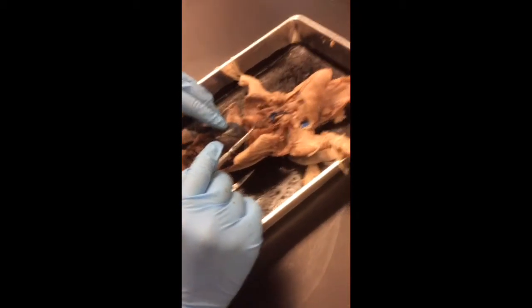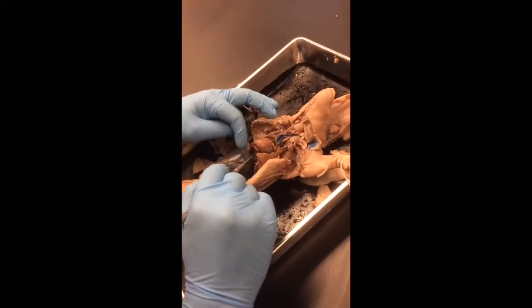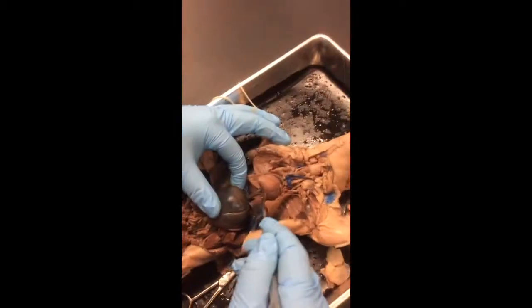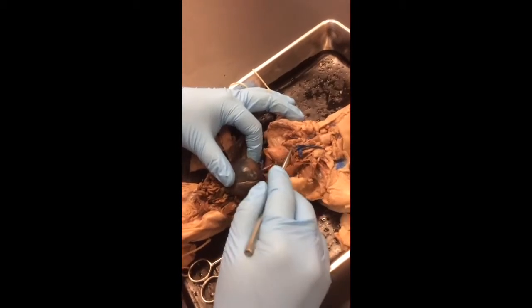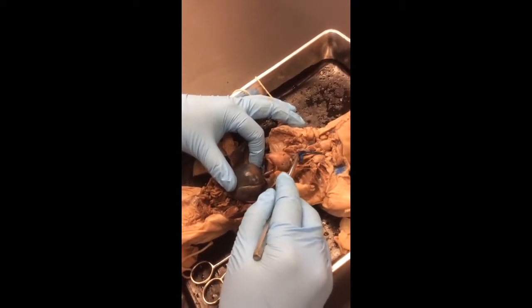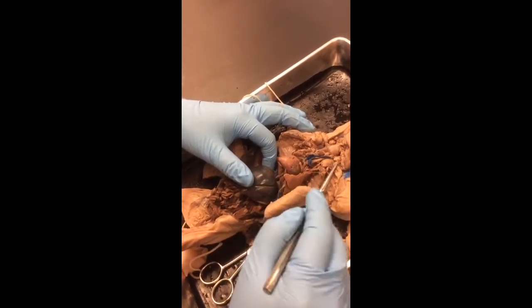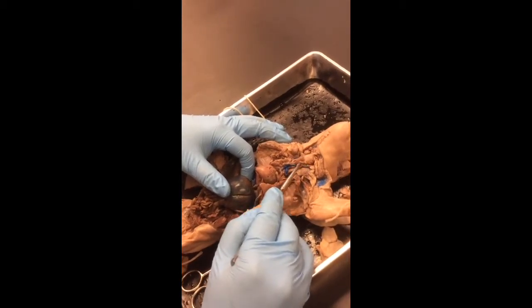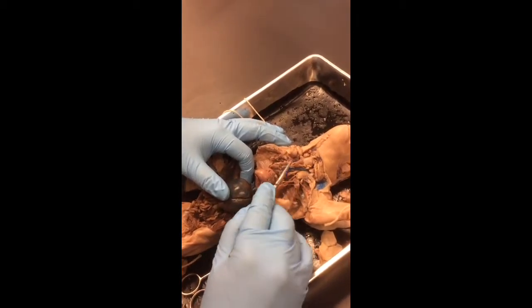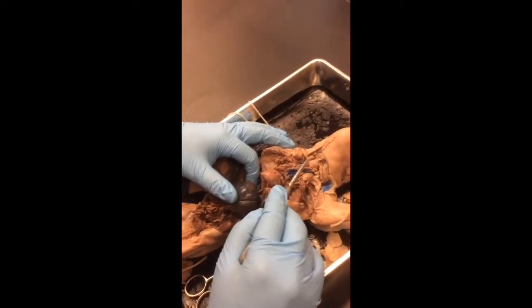All right, posterior vena cava is the inferior one, so we usually show it right here underneath the heart, above the liver. Right, it's bluish and round. Inferior or posterior vena cava. The anterior or the superior one's here, but we tend not to pin that. Pulmonary vein we don't have to worry about. Jugular vein is in the throat up here. So if you see a blue blood vessel going through the throat up the head, jugular vein. You don't need to worry about interior versus exterior. Just jugular. It's fine.